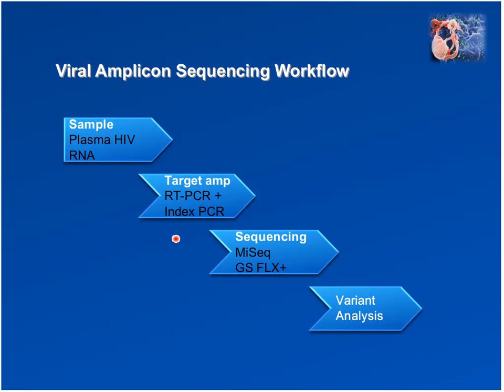Each amplicon was uniquely tagged through PCR with a barcode sequence, an MID, or a MiSeq index sequence. The amplicons were then pooled to form an amplicon library containing 48 uniquely tagged amplicons, which were then sequenced on the two platforms that we're comparing data from today.